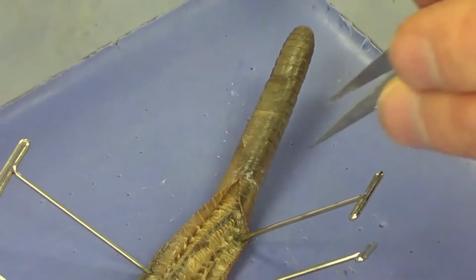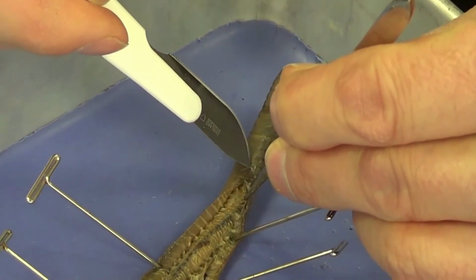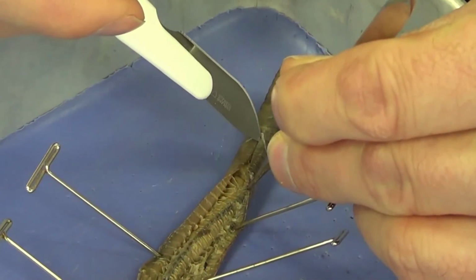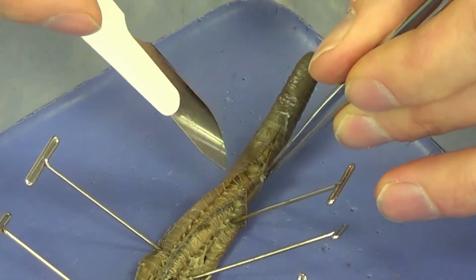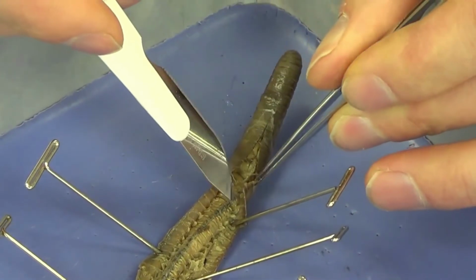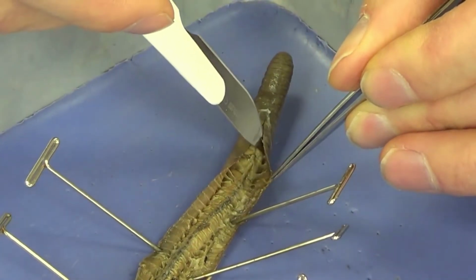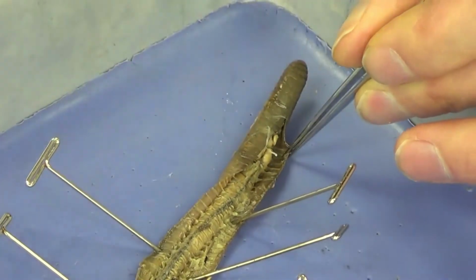Let's go ahead and go a little bit further here. I'm going to tent the skin up a little bit and continue cutting. And I'm going to try to be very careful that I don't puncture any of the organs here. There's a lot of good organs here and we don't want to cut them.